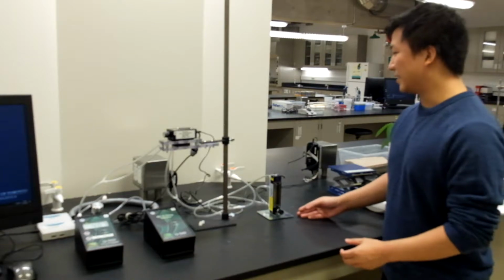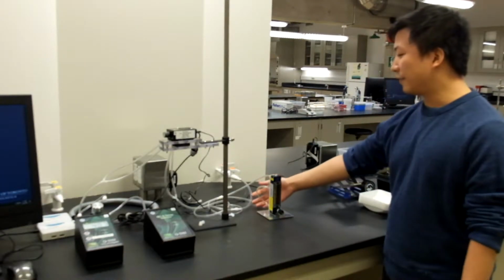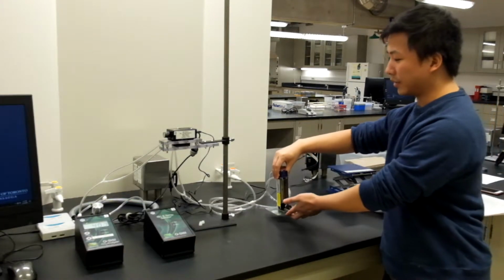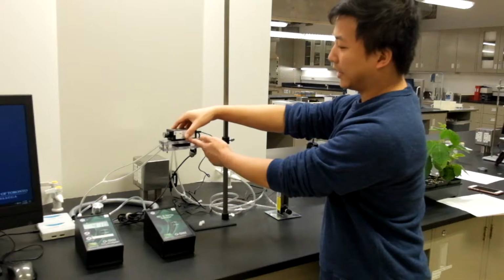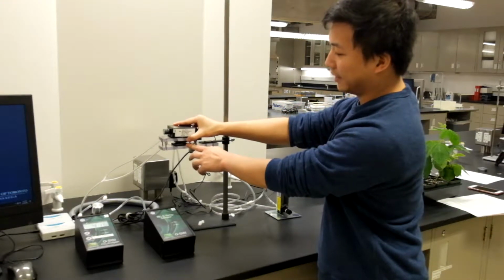Here's the gas exchange system. We have the air line that we must turn on. Air will then flow through into the flow meter, which adjusts the rate of airflow throughout the system. Air will then flow into the leaf chamber, which is located here. There's a light source on top of it, and then the leaf fits inside the little chamber here.